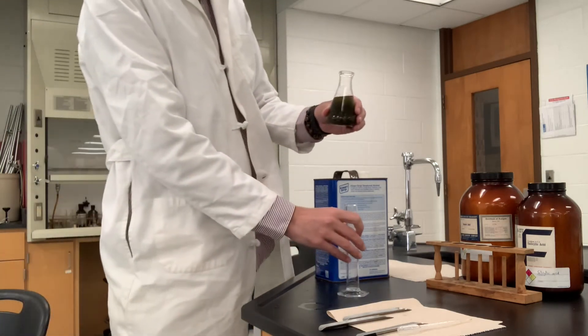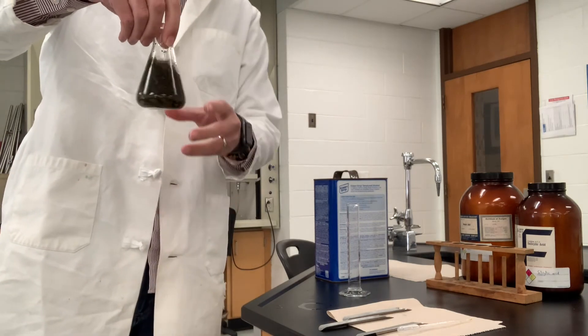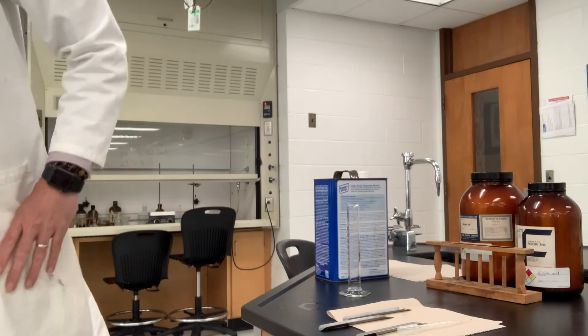That's pretty high up in the flask now, and we might be able to get a slurry action going with the stir plate. I'm going to grab a cork and some aluminum foil — we want to do this in the dark so that no photochemical reactions or decomposition occurs. We'll cork it tightly and put it in the fume hood on a stir plate for overnight, like 48 hours if we can.